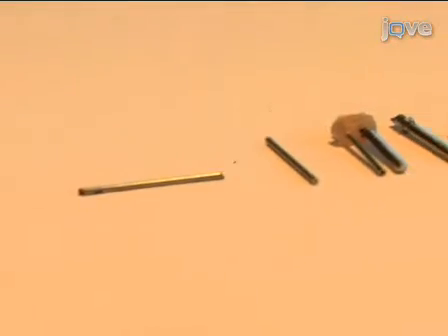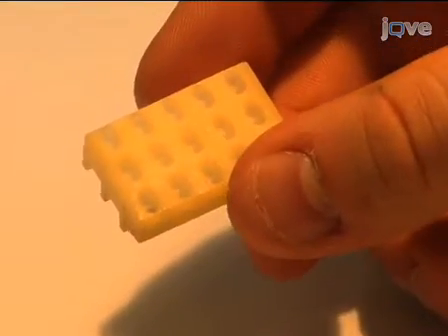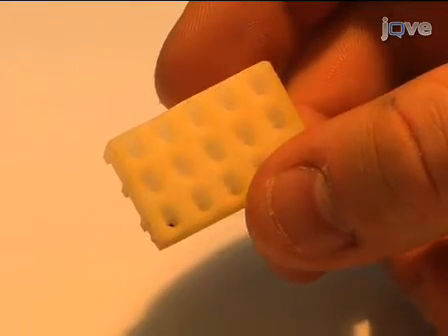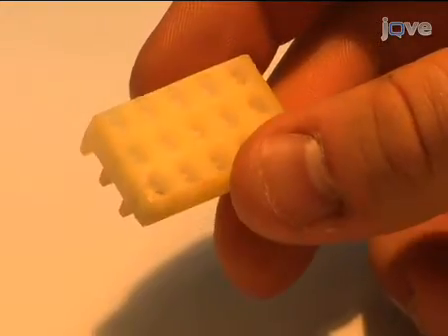The microdrive is made by molding dental acrylic around the screw and the support tube. The molds we use are 3D printed plastic, just like the plastic base, and have holes in the bottom that keep the screw and the support post aligned as we pour the acrylic into the mold.